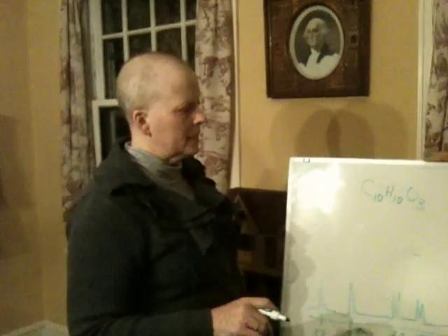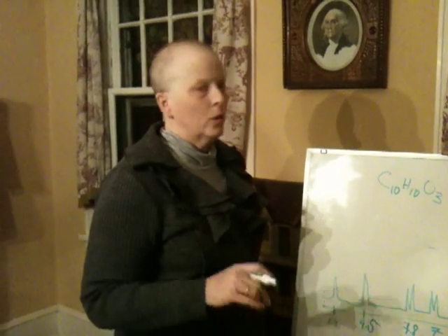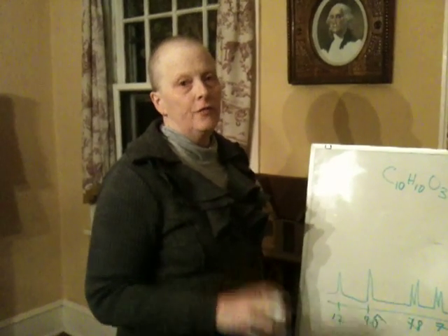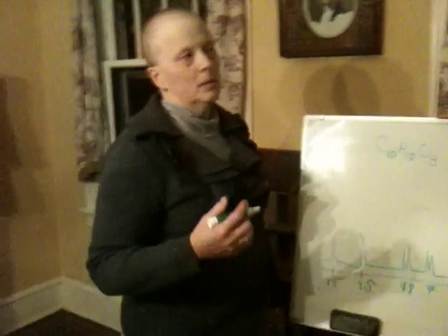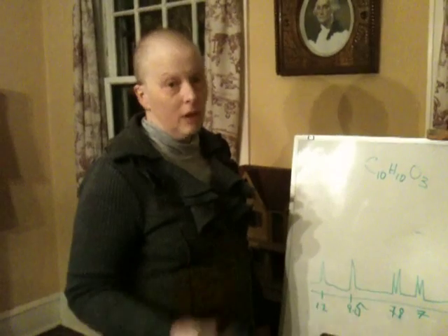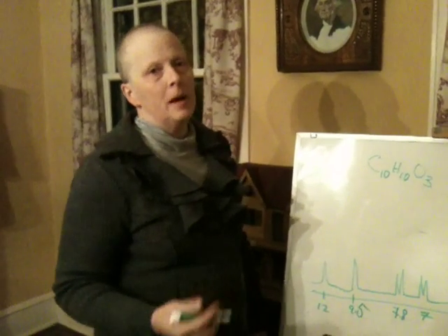Class, I'm sending you an auxiliary NMR IR problem. Again, the more you see of these, the better. I sent you 5 over the weekend that you should take a look at. The more you supplement this, the more problems you try, the better you'll get at this. And you learn something from every problem you do.